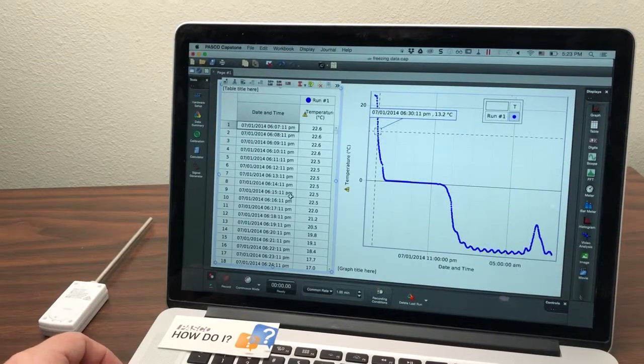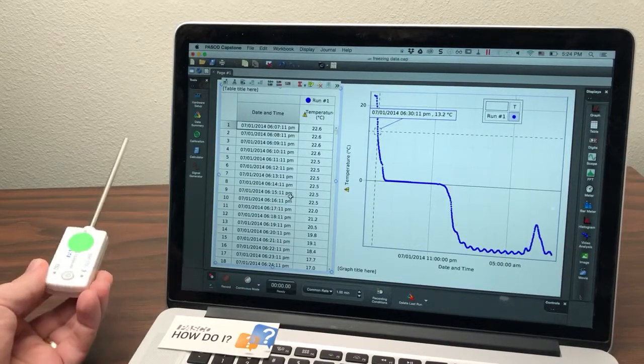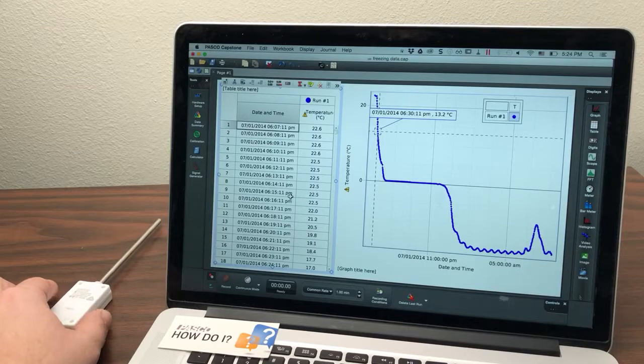We hope you find the new date and time option handy. I think it'll be especially useful for long-term experiments, which are especially easy to do with wireless sensors, since we can log data with things like the wireless temperature sensor and the wireless weather sensor.